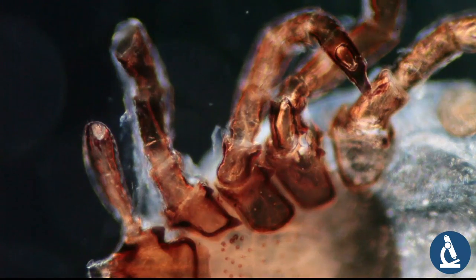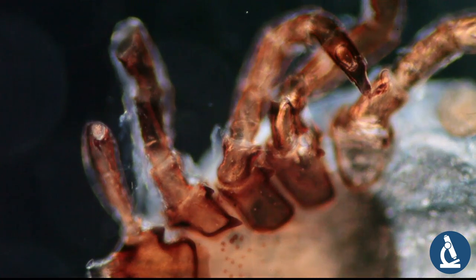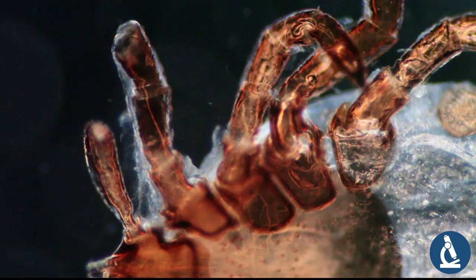And what we can also see is that one of its legs is missing. On the top left, you can actually see that this leg is a little bit shorter than the others, and the reason is that part of it was torn off.